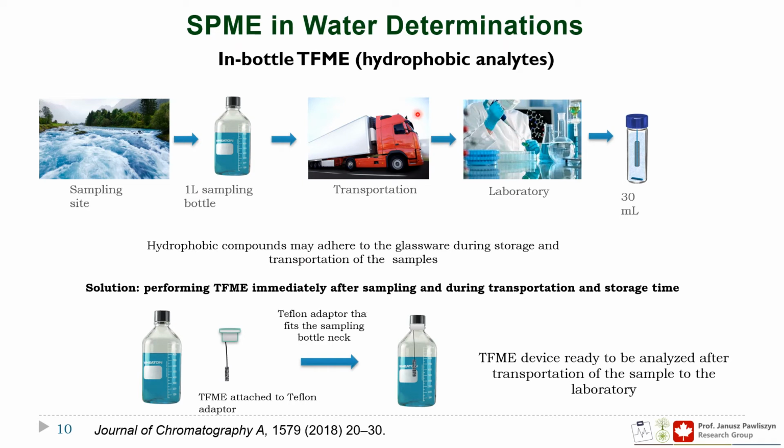Practically, we try to use it to develop an effective way of water analysis. I'm very concerned about the current state of the art of doing water analysis, which is based on liquid extraction. So you sample the water, typically in a 1 liter bottle, then you do liquid extraction in the laboratory. You can do a subset of analysis using SPME, which was tried a long time ago. However, it was found that for hydrophobic analytes, you're losing some of the analytes on the surface of glass. So liquid extraction data are not the same as SPME data or SPE data.